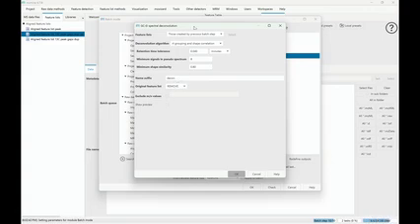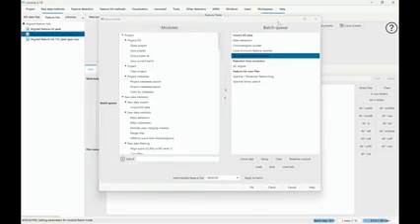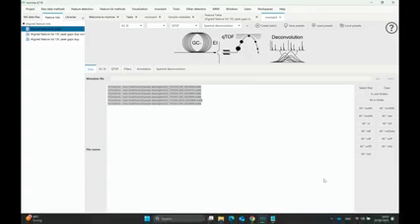You can always show a preview and then look at the results. I'm not going to go into that now, but we have some videos where we actually show this. So just go on YouTube. If you work on GCMS data, go on YouTube, find the GC-EI-MS workshop that we did with Vimo, and you're going to find more of the results there.